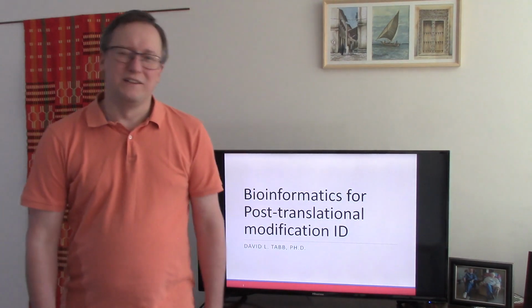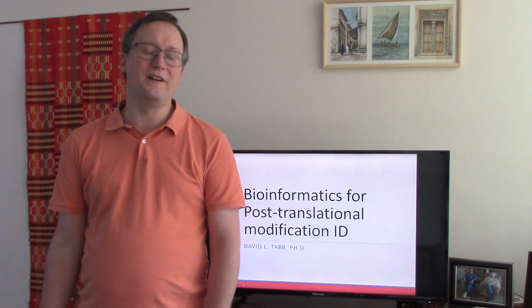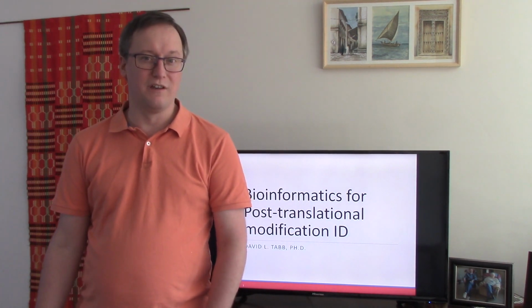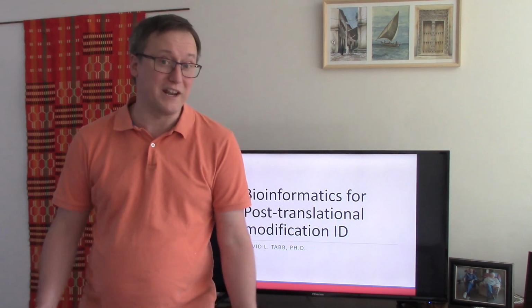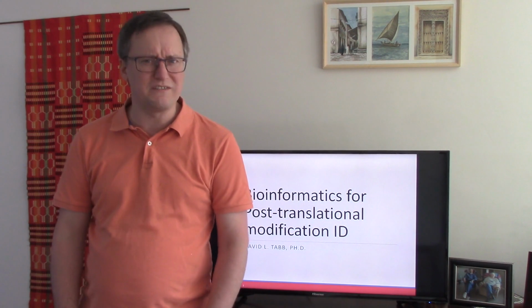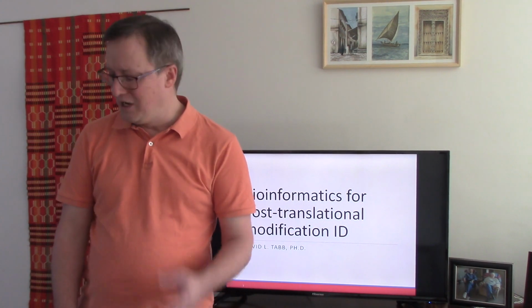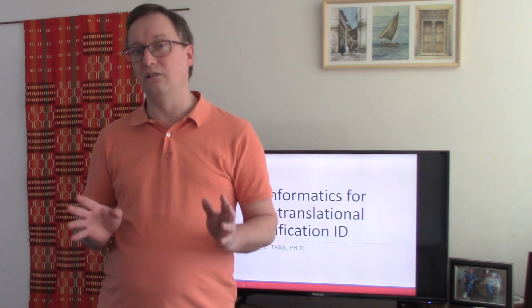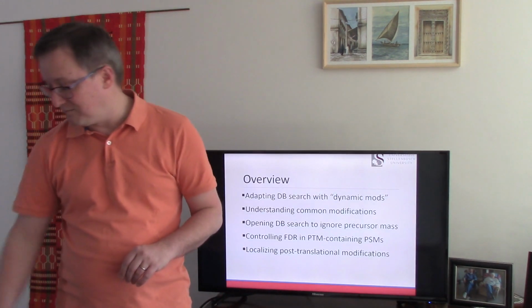Good day. Today we are going to investigate the fine art of identifying post-translational modifications from MSMS data via bioinformatics. So I realized it had been a few years since I filmed a video on this, and a lot of stuff has actually been going on in the meanwhile. So today we're going to talk about some of the different ways that we use algorithms to reveal post-translational modifications.